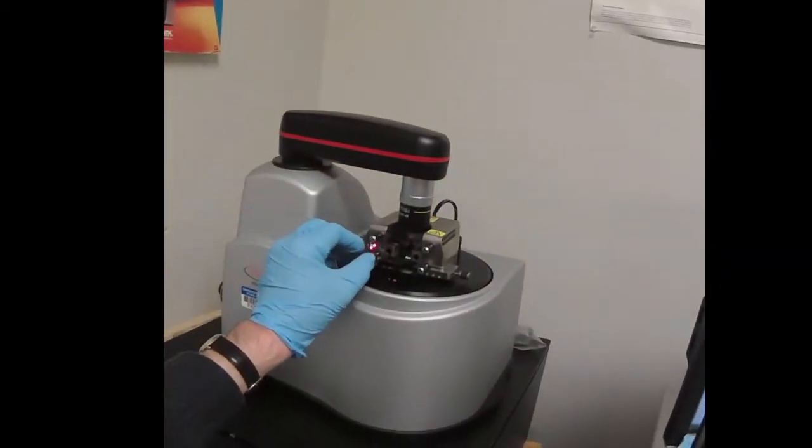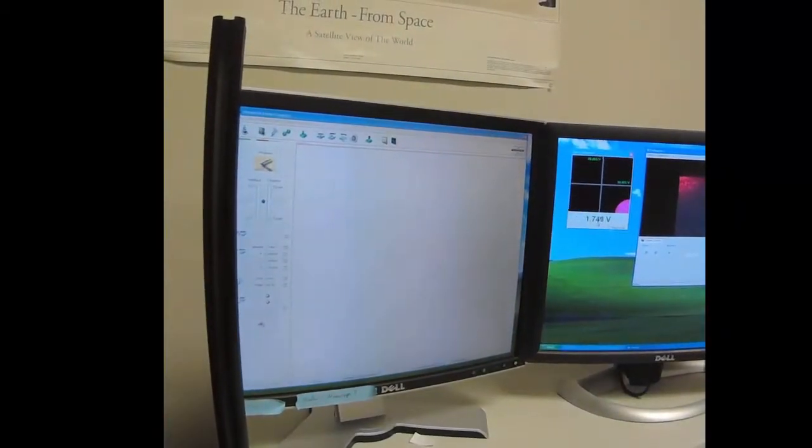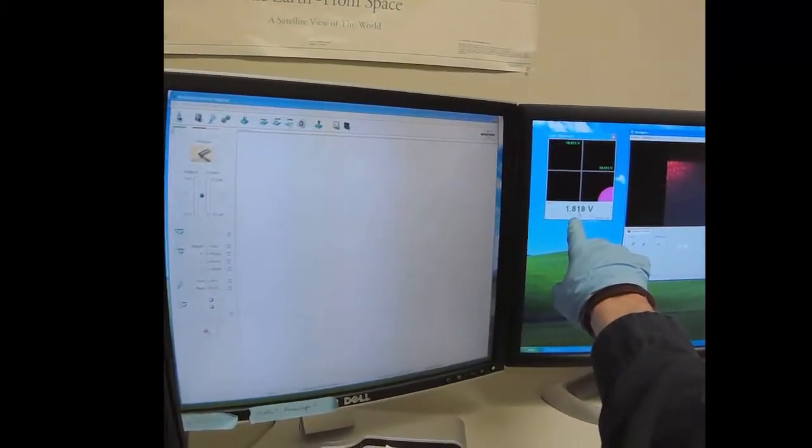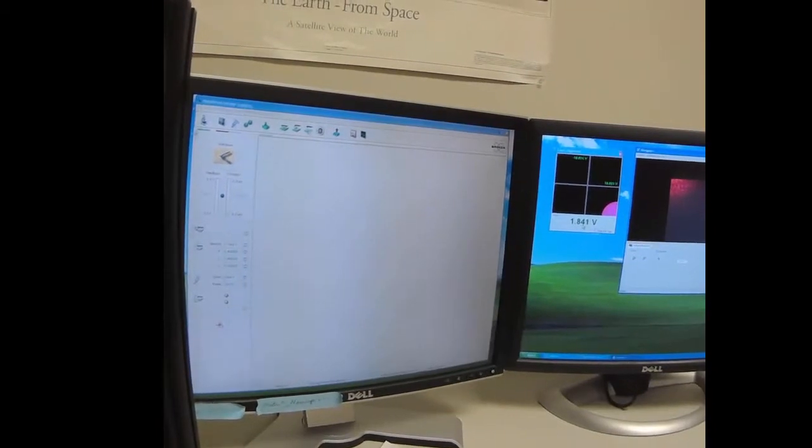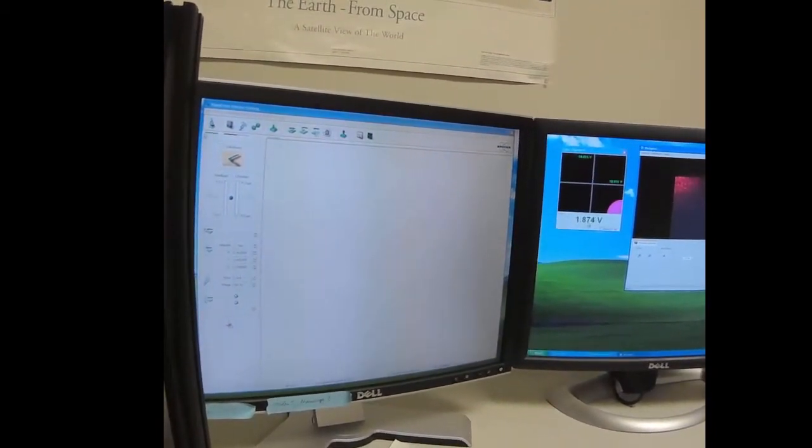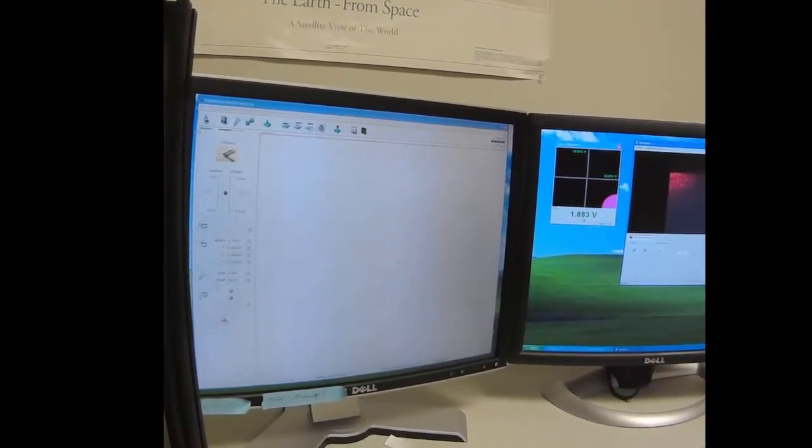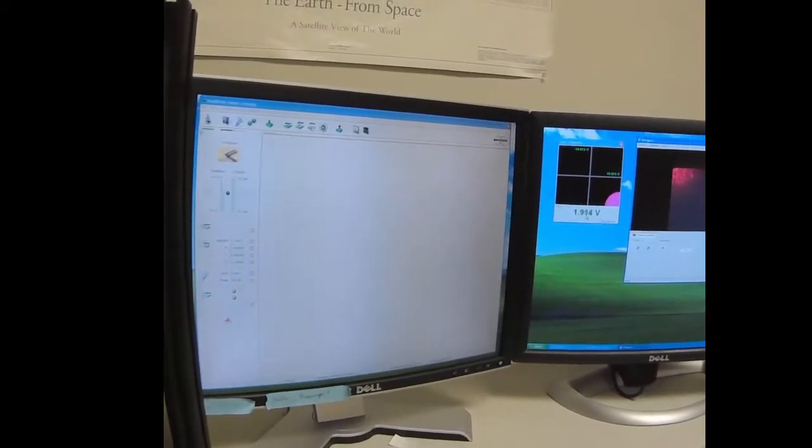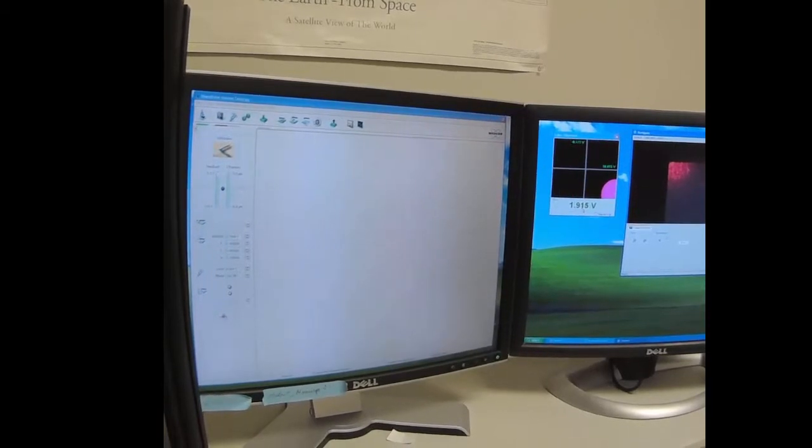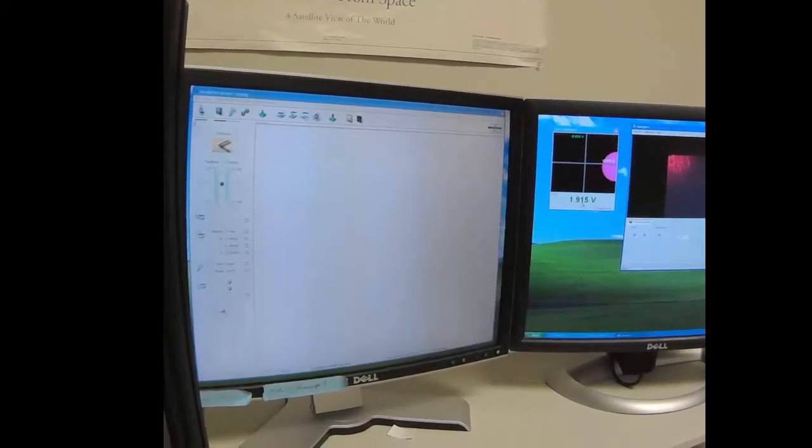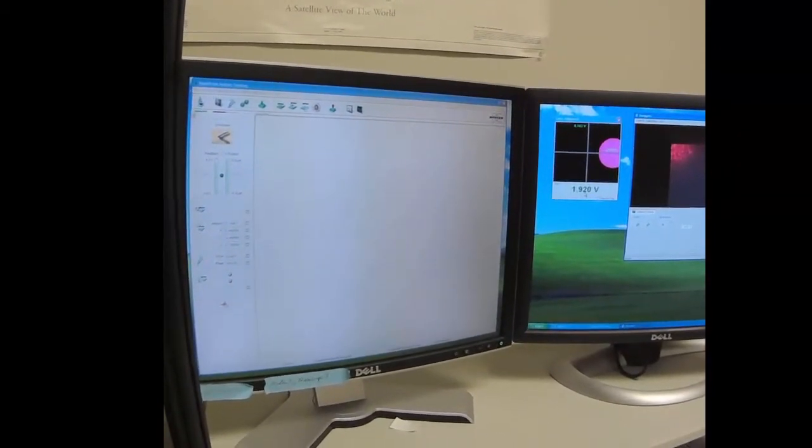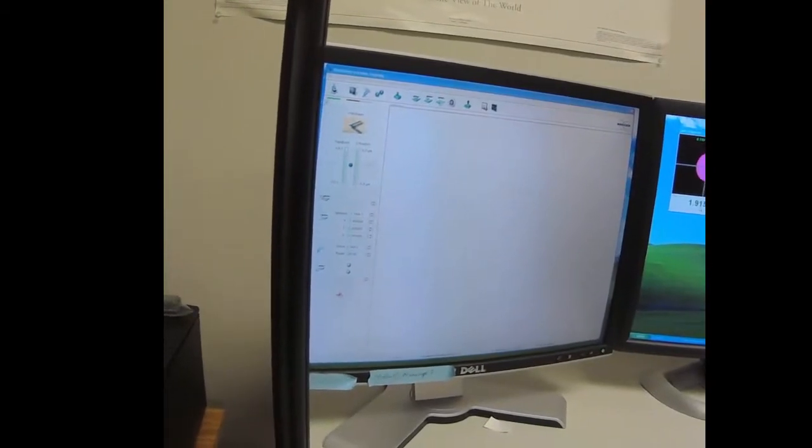So as I move these knobs, I can adjust that spot. Initially that spot probably isn't going to move, but I am moving something because this signal is getting stronger. So I am moving in the right direction. Again, gently rotate so you can see what the changes are. Although this is a digital instrument, this part working with the knob is clearly an analog process. I'm tuning, trying to center the signal and get the maximum signal. Now I switch to the other mirror. And there's some crossover with the mirror. So as you turn one knob, turn the other knob, it doesn't always do exactly what you'd expect.